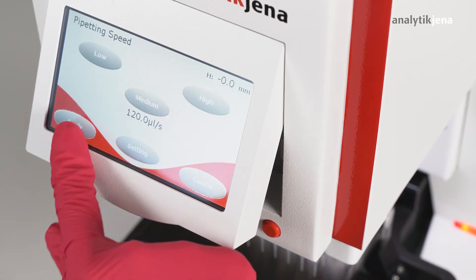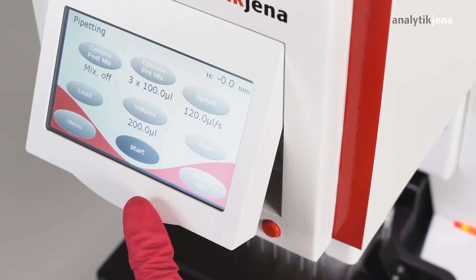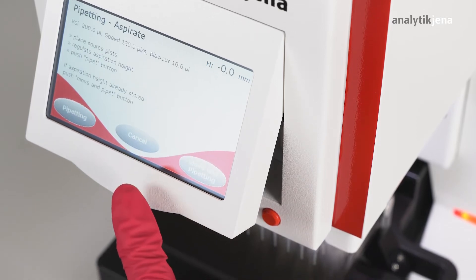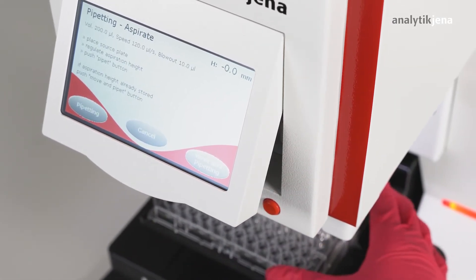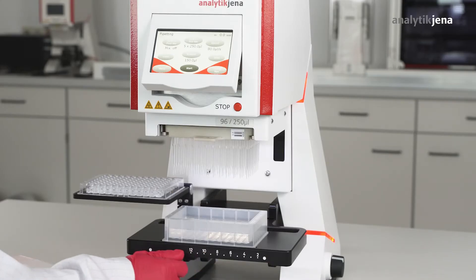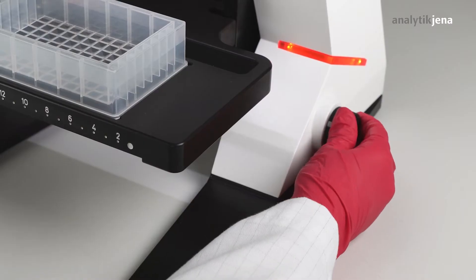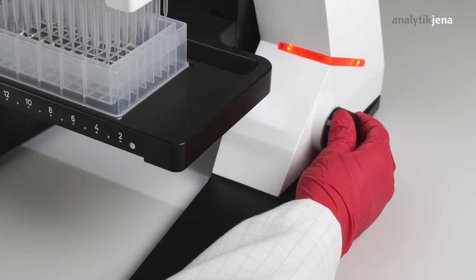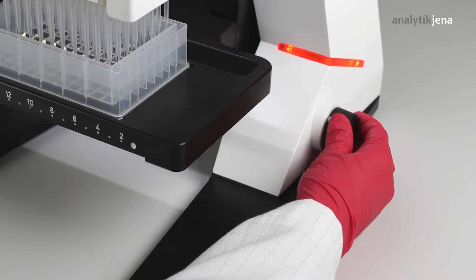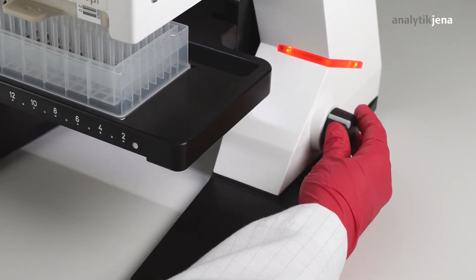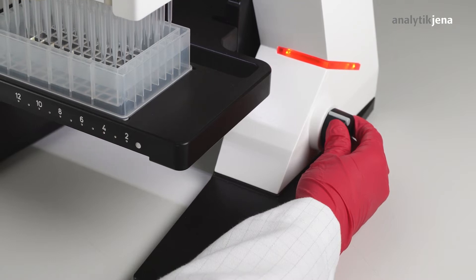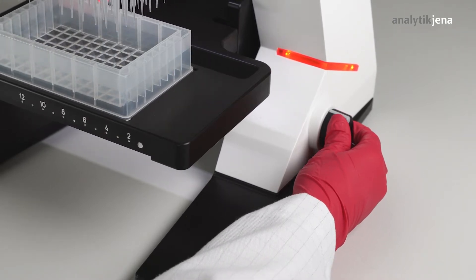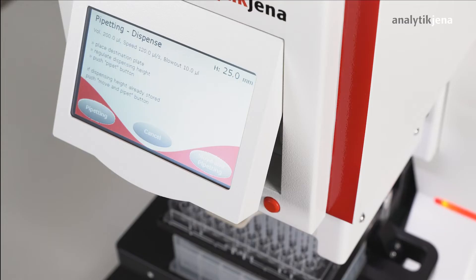After setting the desired parameters, the user confirms with Start and is then guided step-by-step through the method. To create a method, the heights must first be set manually. The pipetting head is moved downward or upward by using the rotary knob. The height is shown in the upper right corner.